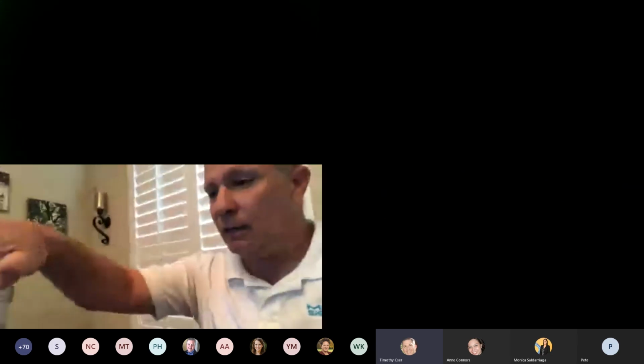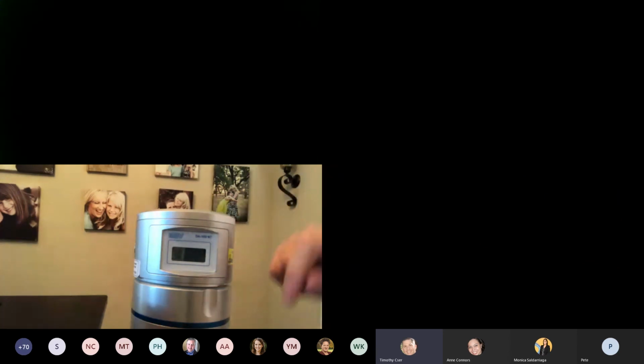Now, what about the day-to-day performance test? This is even simpler. So I've got my Da100. Let me point that out here. Sorry. Got my Da100 here, and I've got my MAS100, and I turned it on, and it's at the start menu. So at this point, I just hit start, and I could put my Da100 on top and see what it's reading. And this is under normal conditions. I could even put a plate in here if I wanted to. Again, that's going to be a minor variation. I wouldn't worry about that because we just want to make sure that it's running at the right speed.